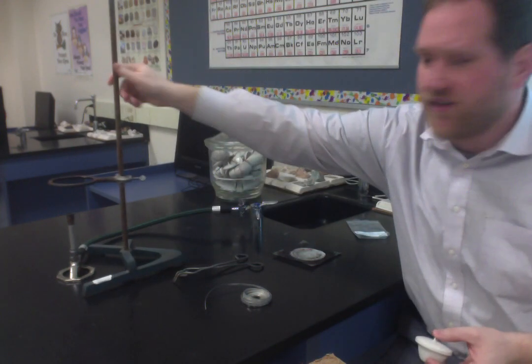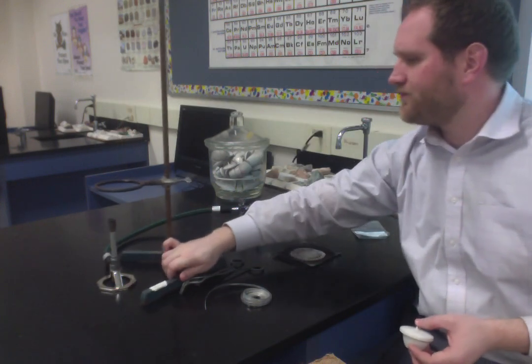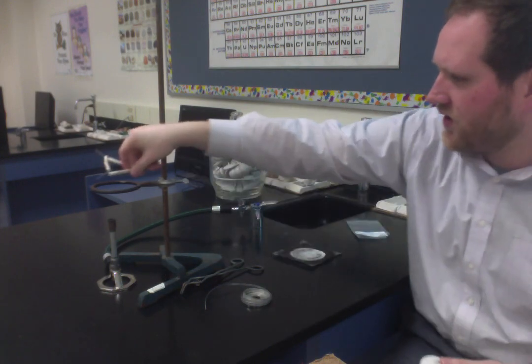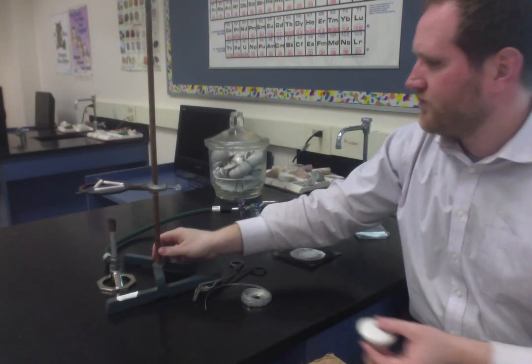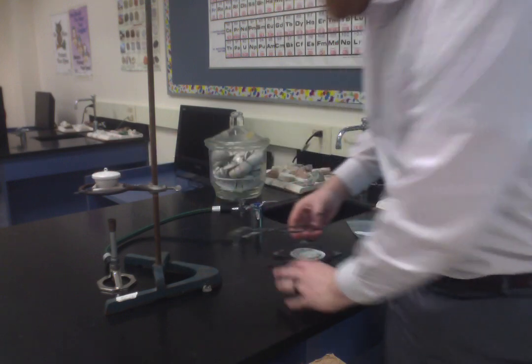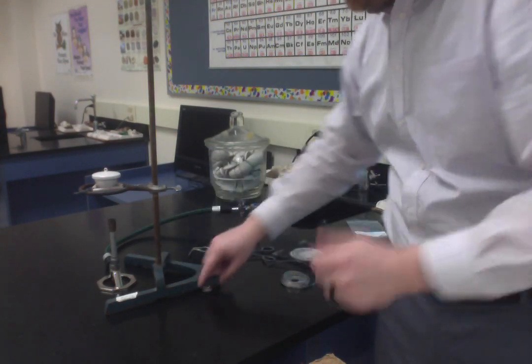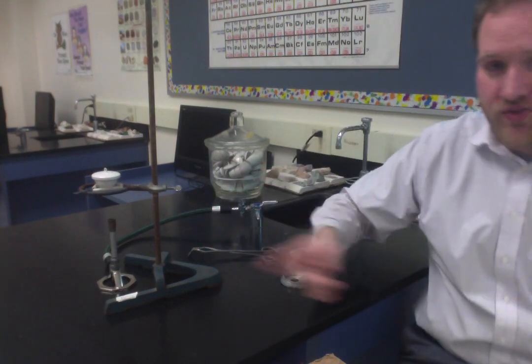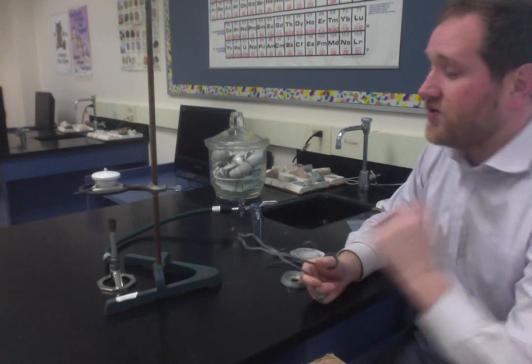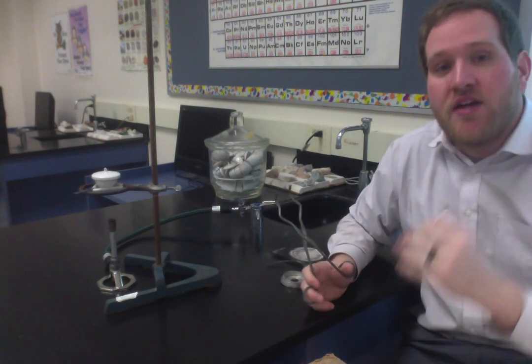So, the ring stand goes above the Bunsen burner flame. Get that in line there. To hold the crucible above it, you use this ceramic triangle here. And the crucible is going to sit nicely on that. And of course, the magnesium is going to go inside the crucible. And at this point, once the burner turns on, everything's going to be way too hot to touch, so you're, of course, going to use your crucible tongs for this. So, picture this flame being on, and you're burning your magnesium.